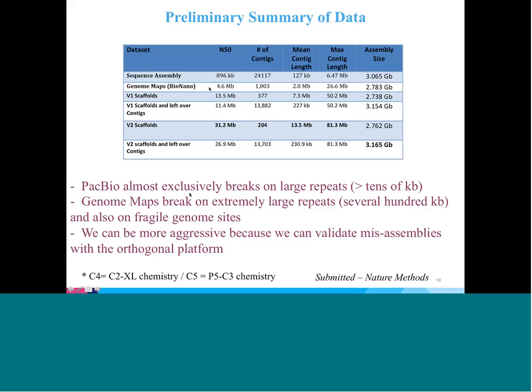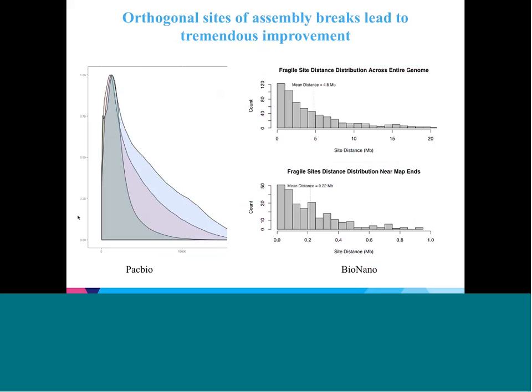So why is there such a dramatic improvement? You see this from 1 megabase to 30 megabases, even though the genome maps are only 4 megabases. That seems kind of non-intuitive. Why are we getting such a substantial improvement? Well, it's because the reasons why the contigs are breaking are somewhat orthogonal. In general, Bobby mentioned that there was a particular read-length distribution for PacBio. In our data set, recall this is somewhat earlier data, but most of our data is less than 10 kb.